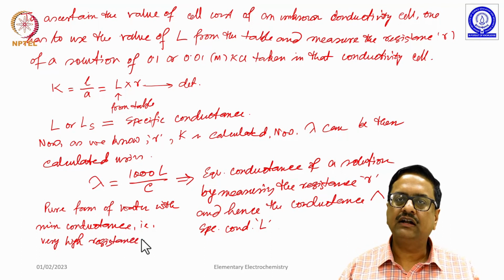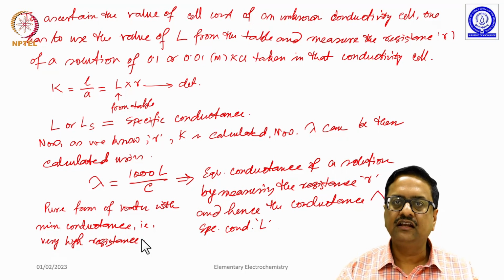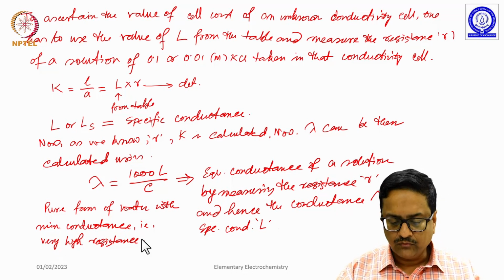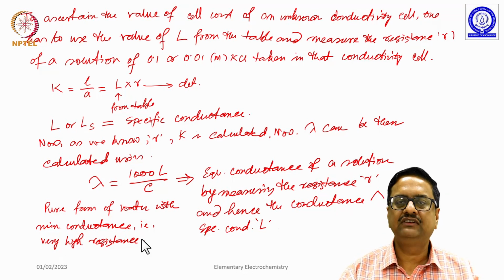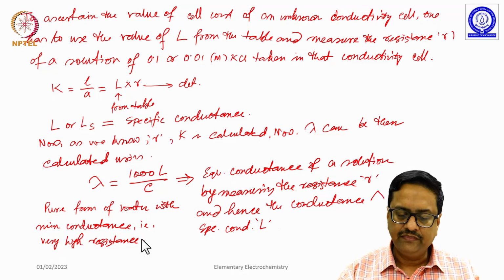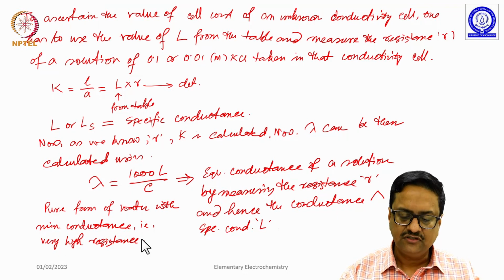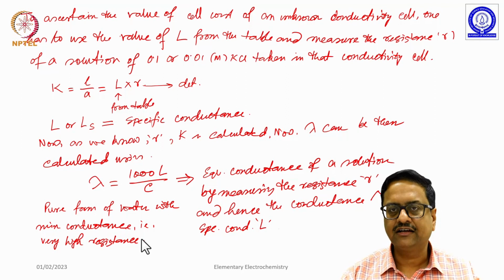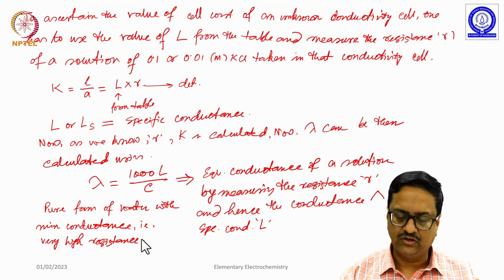So, how is this water produced? First one has to distill a normal water, tap water or any water. One has to distill it at least 2 times, one time distilled, collected and redistilled and collected, and then that water is passed through ion exchange columns to remove any residual ions of carbonate, bicarbonate which may be there because of dissolution of carbon dioxide in water.